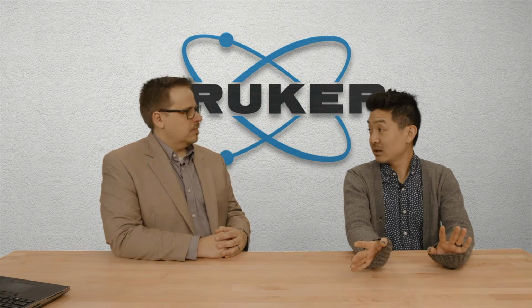But the other thing that people are often interested in is quantification. Like most analytical techniques, more intensity means more stuff. If you have a lot more of a material in your sample, then you would expect to see more intensity. We can see this as simply as if you have a sample holder and you put just a little bit of material in there, then you don't get quite as much intensity. But if you really pack it with material, then your intensity will go way, way up.